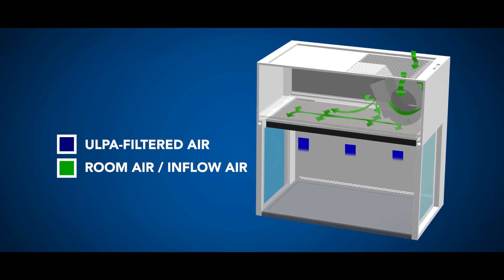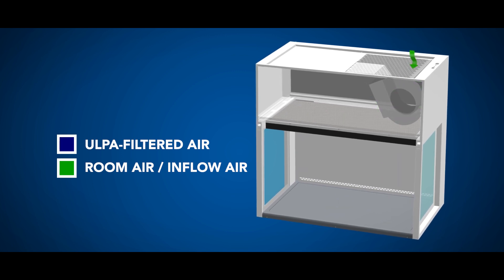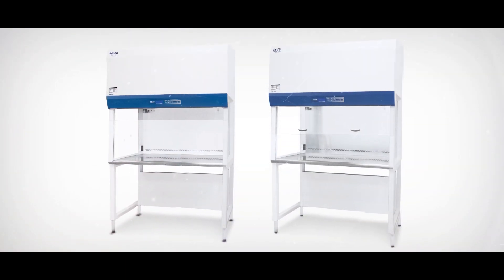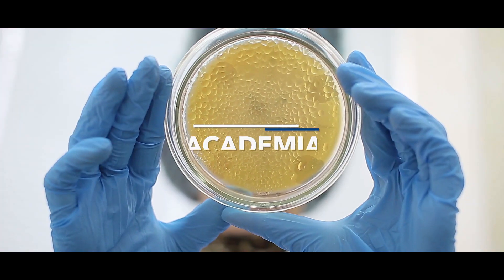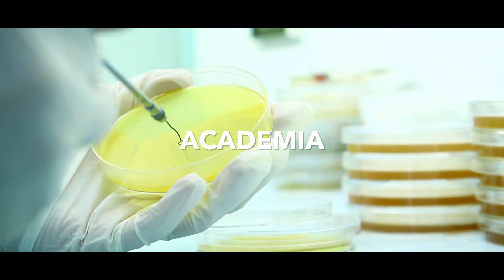The purified air travels in a vertical, unidirectional stream across the front and back of the work zone. The Vertical Laminar Flow Cabinet has a wide range of applications. In academia, it can be used for media preparation and culturing of non-pathogenic microorganisms.